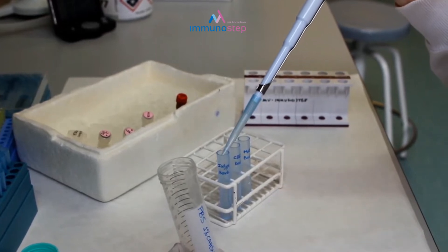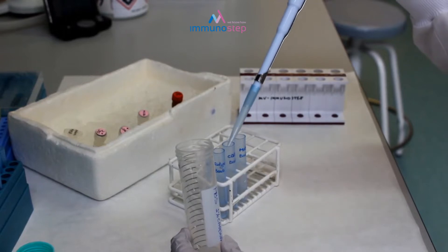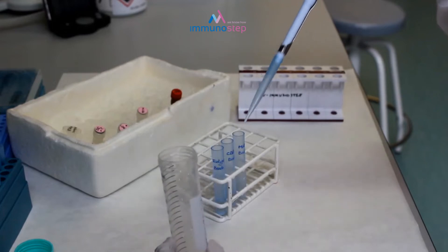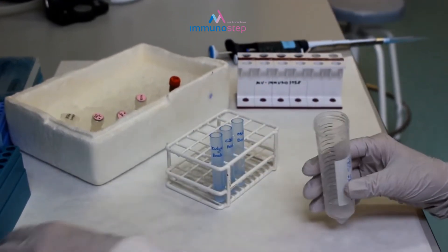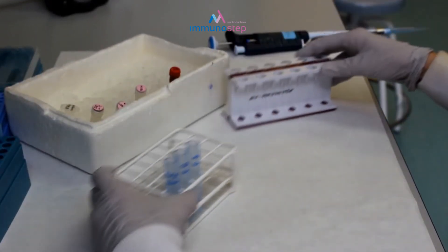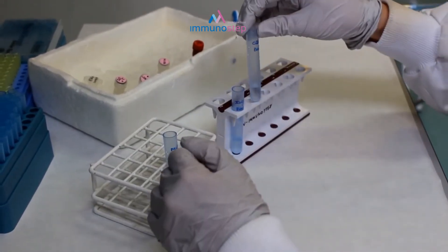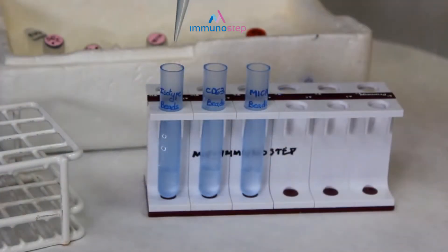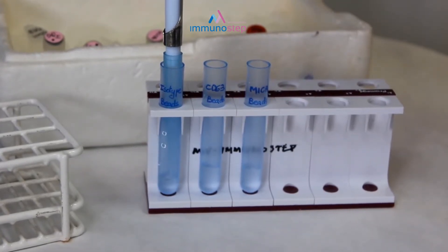Once we have the EVs immobilized on the capture beads, we wash by adding 1 ml of PBS casein. Since the beads are magnetic, you can recover them by placing the tubes in a magnetic rack for 5 minutes. After that time, we can gently aspirate 1 ml and discard it.